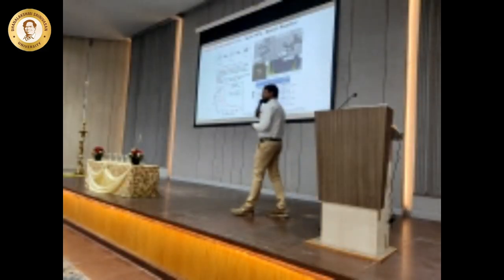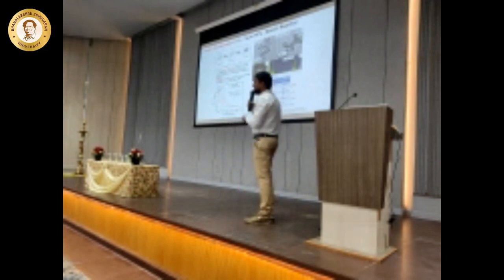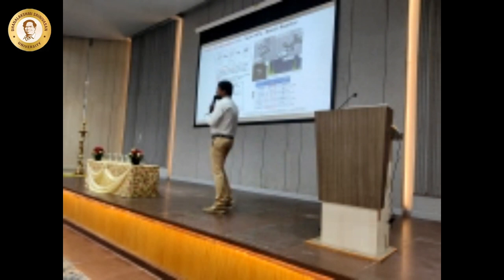So we made a material, and we used different structures. A microemulsion method is a batch process that we made. We are trying to bring this into microfluidic devices, and we are still working on these protocols. The microemulsion method doesn't require any heating or pressure. It's a simple technique wherein we used europium doped with tantalum oxide. Tantalum is a very good CT contrast agent, and europium is a very good optical agent, wherein even if you excite with UV, europium will also give you a luminescence. But the good point is, when I start doping this into a tantalum oxide material, what I found is extremely different.